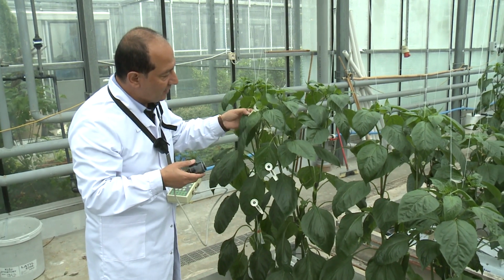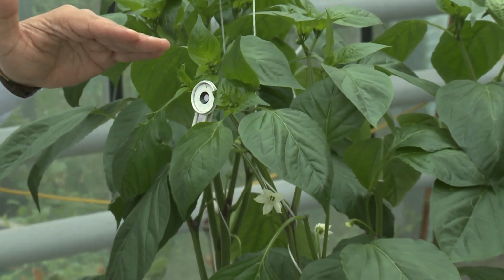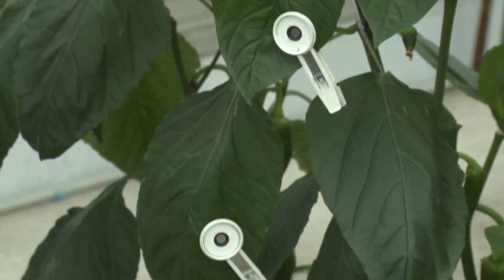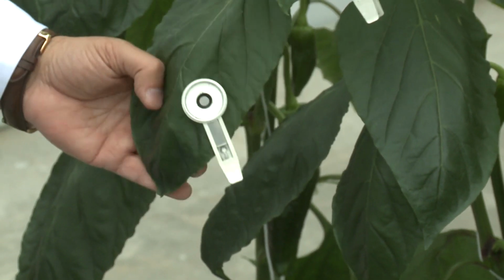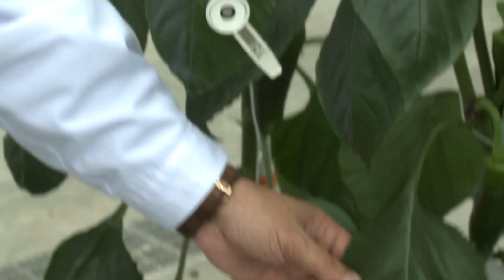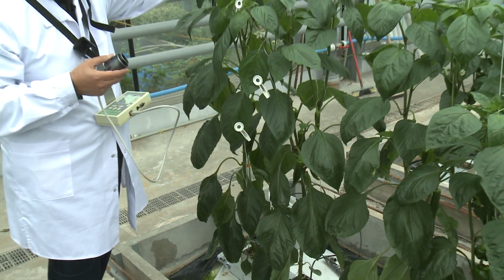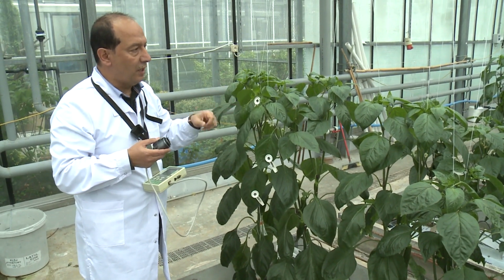we choose, like in the case of chlorophyll content meters, as we said, representative leaves on the same plant from different levels. We have young ones, moderately developed leaves, and old leaves on the bottom. So we take measurements from one side, then from the second side, the third and the fourth, because the sunlight is not equal on our plants in the field or in the greenhouse.